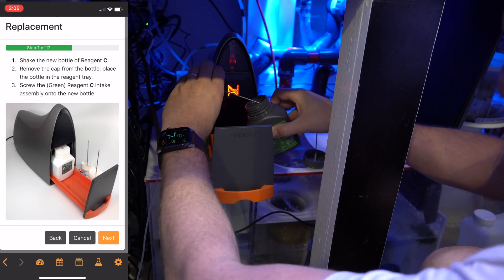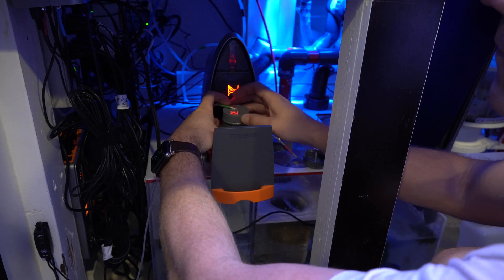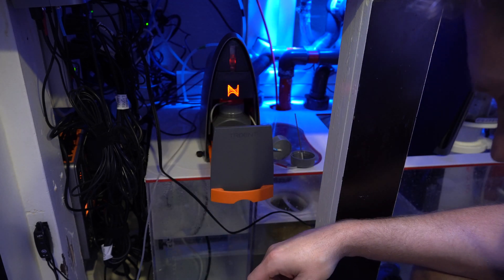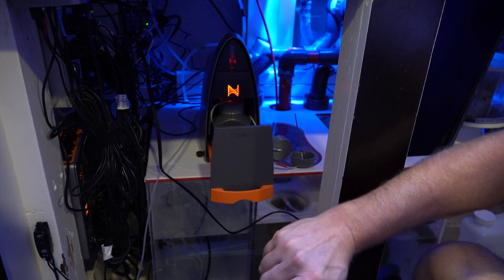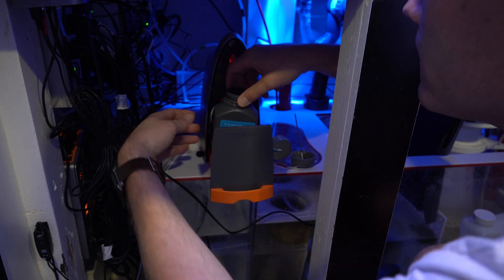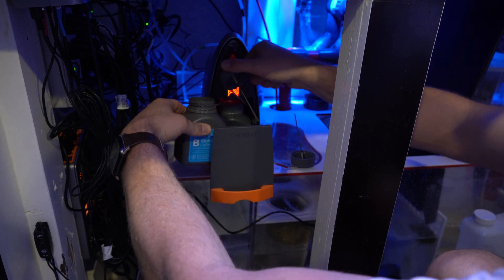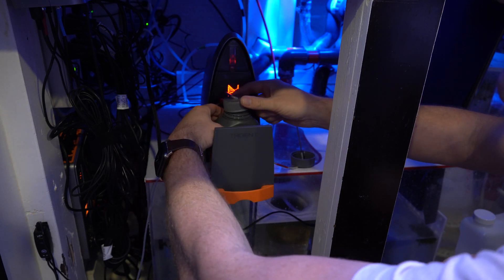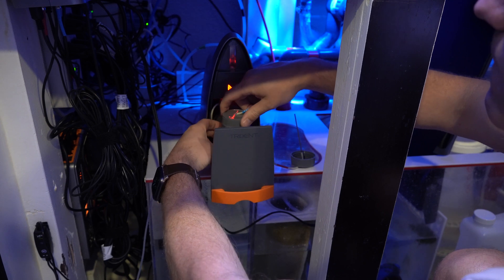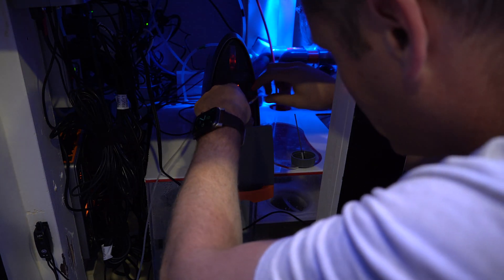Sometimes it's easier to come in at an angle to make sure I don't bend anything. No need to over-tighten this — just make sure you screw it all the way down and it's hand tight. It looks like a little leaked out — got on my hands. Probably good to wear gloves, but that was the one that was leaking, so it was just on the thing. I'm sure I'll live.